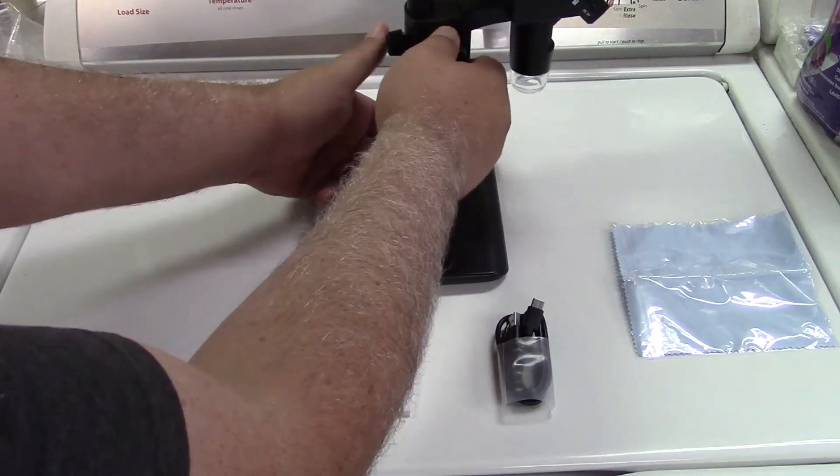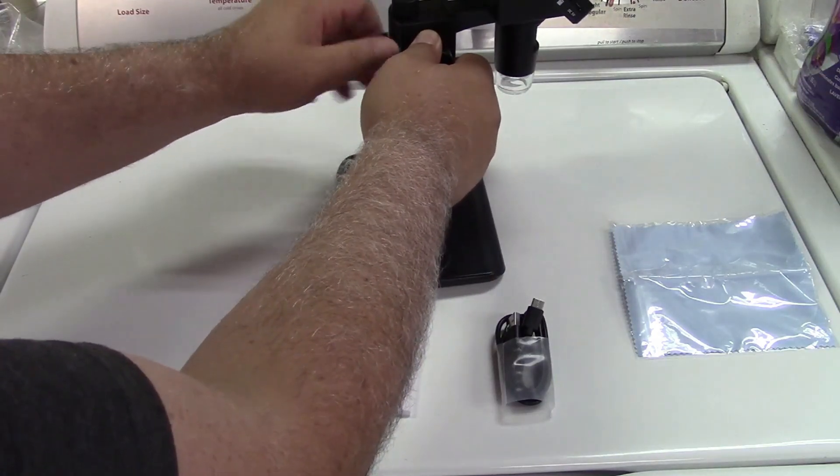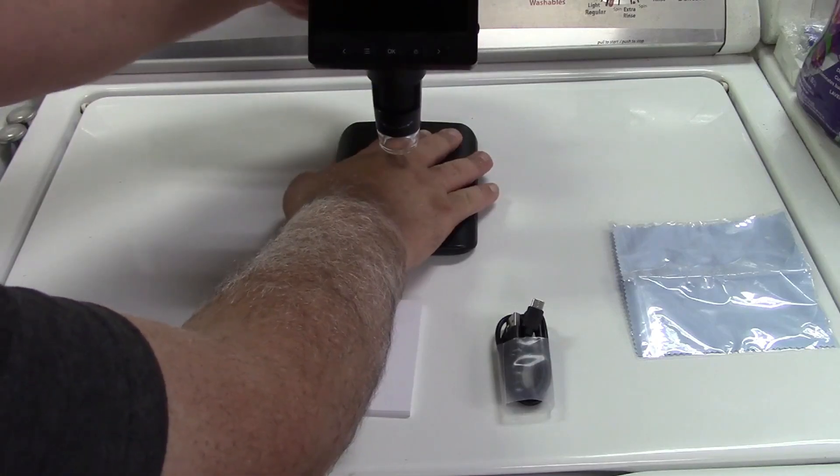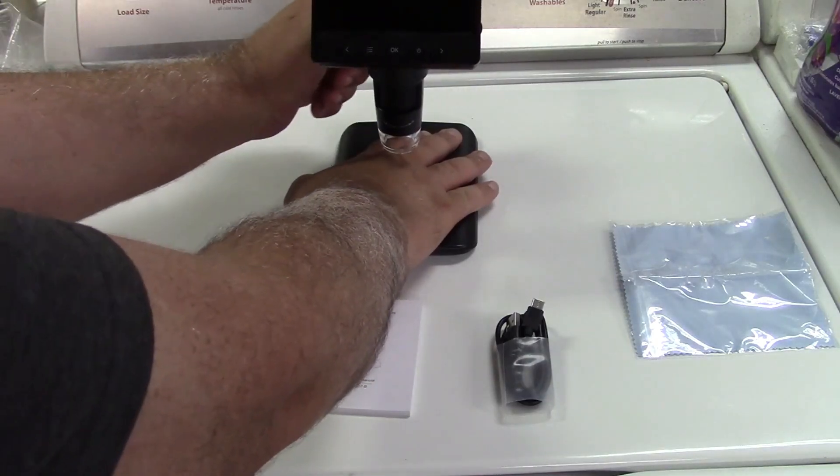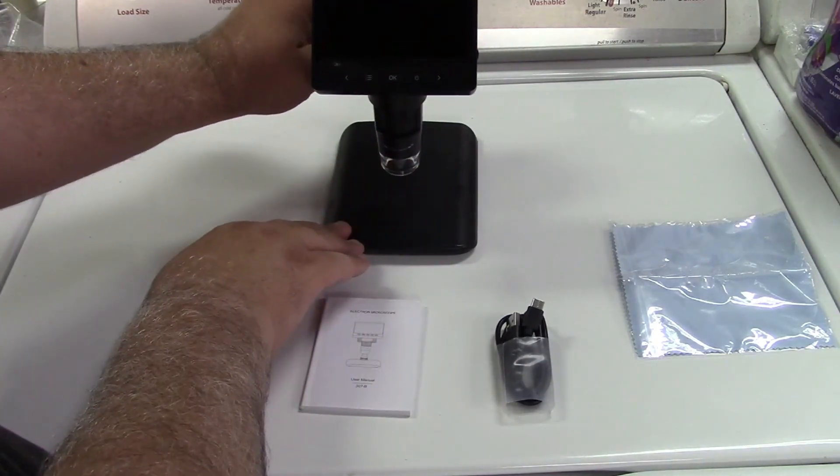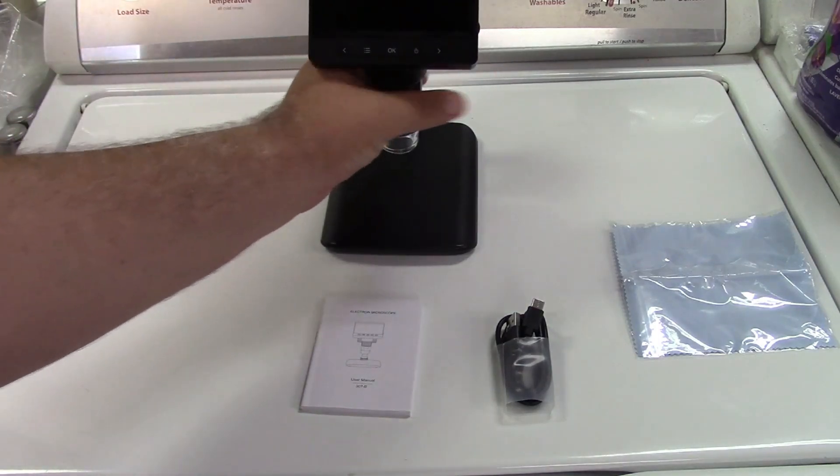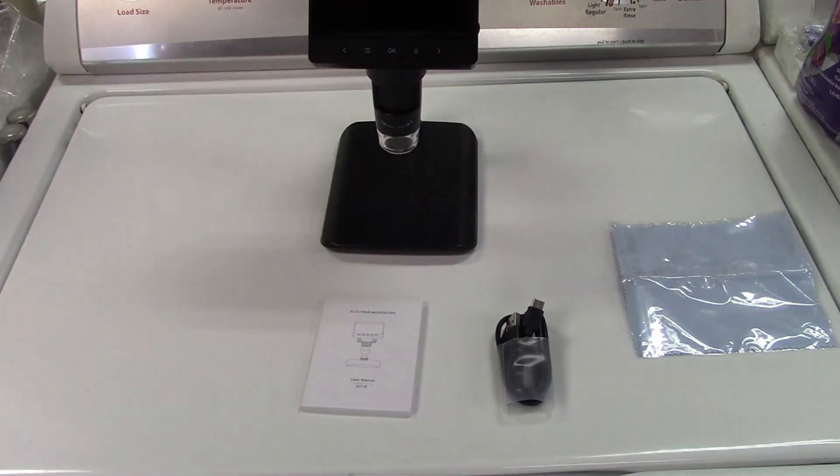We're going to pick that back up and turn it back around. Kind of lock it down. And just like that. And you can also focus right over here. Let's put something in here and see what it sees.